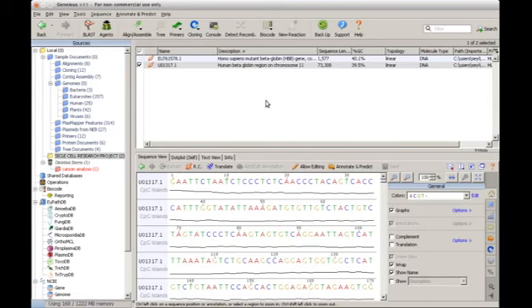Are you getting it now? But if the AT content in the nucleotide sequence is low, while the GC content is high, it's telling you that the nucleotide sequence is stable. So the essence of that is that the sequence has a high capacity to withstand, to resist any foreign invasions.